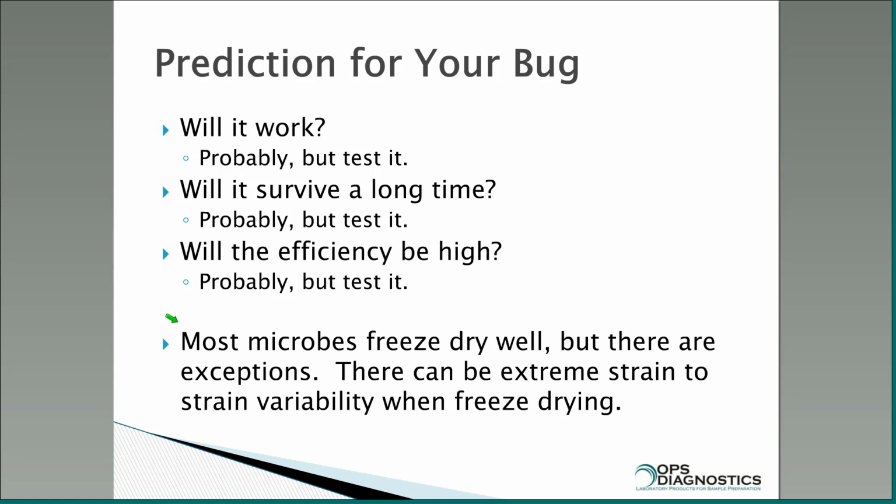As you're going out there, always keep in mind that you need to look at your bugs and test it, and if there's a headache, you may have to tweak your growth medium or tweak what you're using to do the freeze drying in order to get good results.